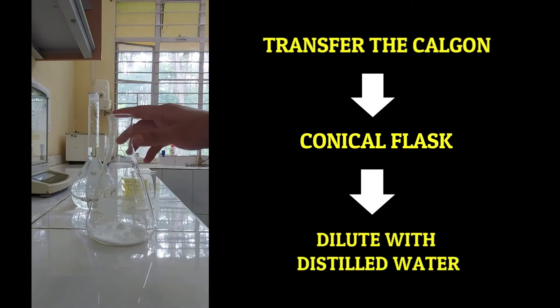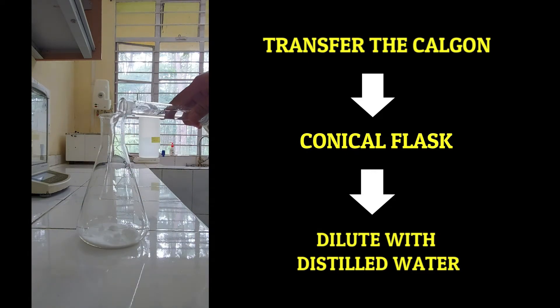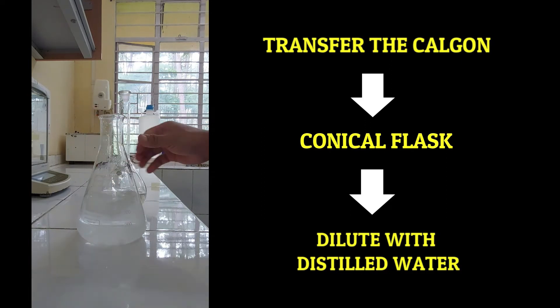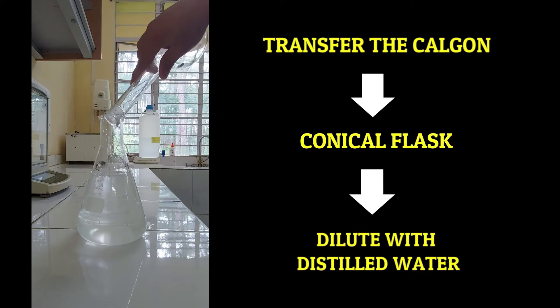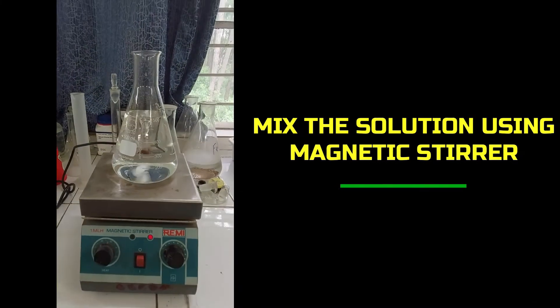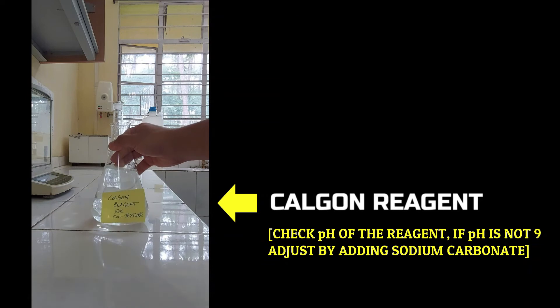Dilute the Calgon with 500 ml of distilled water and shake it for the reagent to dissolve. Use a magnetic stirrer to dissolve the reagent. Now we have a Calgon reagent ready for texture analysis. Remember, before starting texture analysis, check the pH of the reagent. If the pH is not 9, add sodium carbonate to bring the pH of the Calgon reagent to 9.